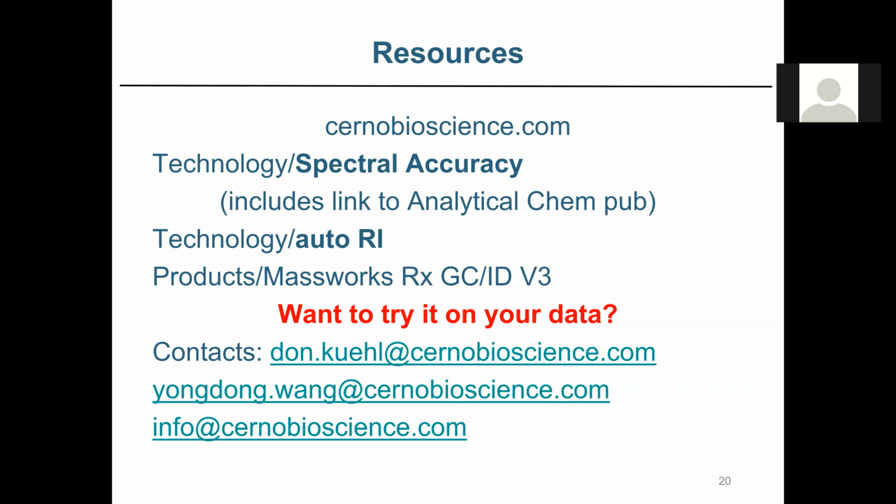Okay, we got one extra question here. Acquisition in profile mode, is it preferred or essential? It depends. Again, it's nice to have that additional information, but it isn't always necessary.